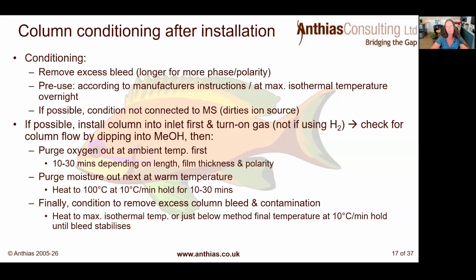But if you can't find the instructions for conditioning, then you should never go above the maximum isothermal temperature overnight. That's the maximum amount of time that you'd be doing that. If possible, try and condition it not connected to sensitive detectors like mass spectrometers, because it will dirty the ion source. So if you have an FID, try and install and condition it on that first.